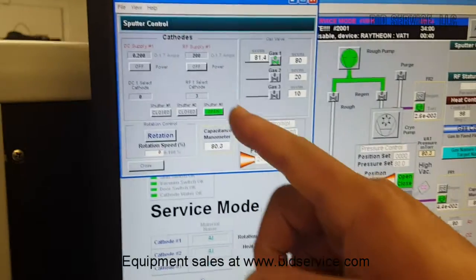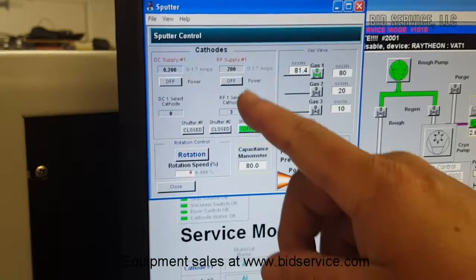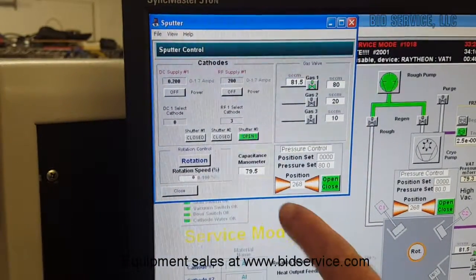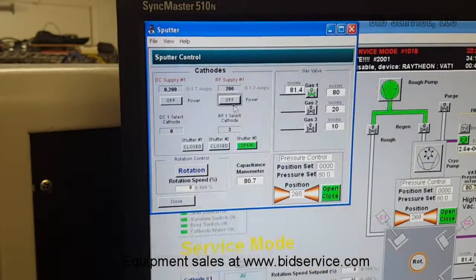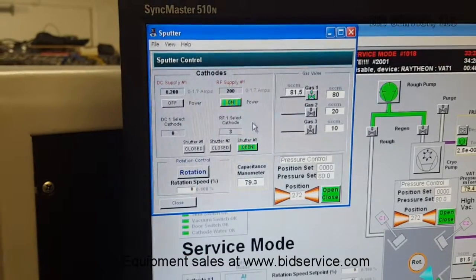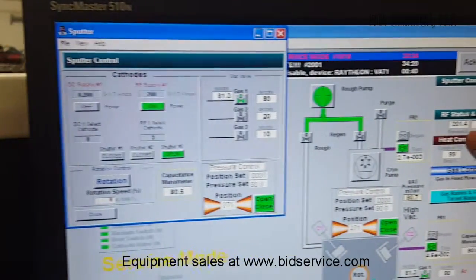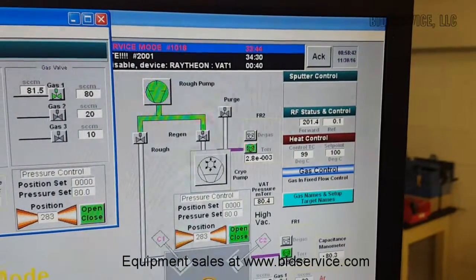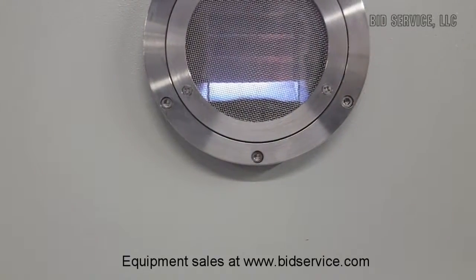On the sputter side, we're going to do our sputter on all three targets to show you that they're all working. Right now I have it set up for 200 watts on target 3, and the throttle control valve is set at 80 millitorr. Now I'm going to turn it on. You can see where it says the forward power is at 200 watts with zero reflective, and if you look into the chamber right now you will see the plasma. And that is on target 3.